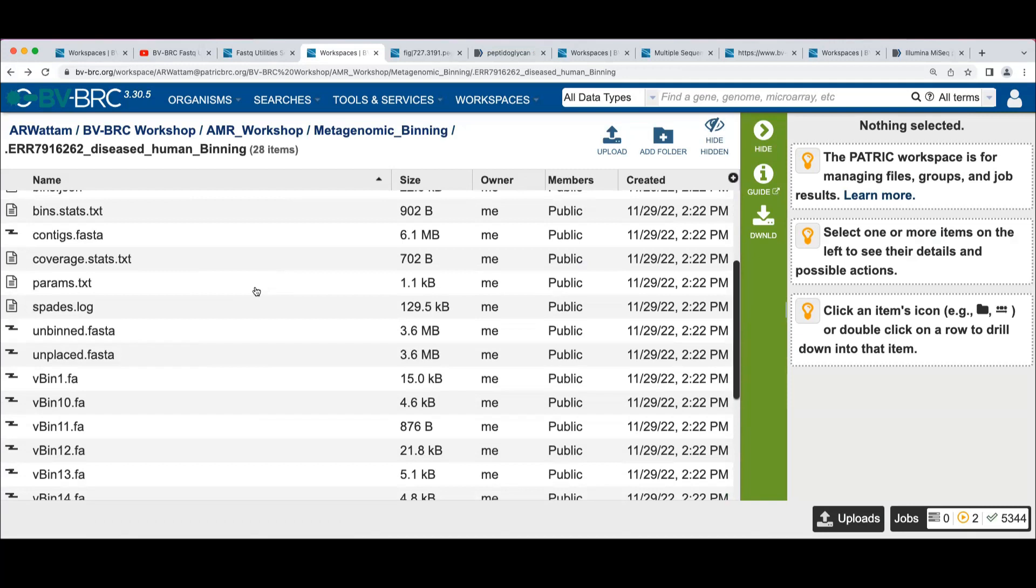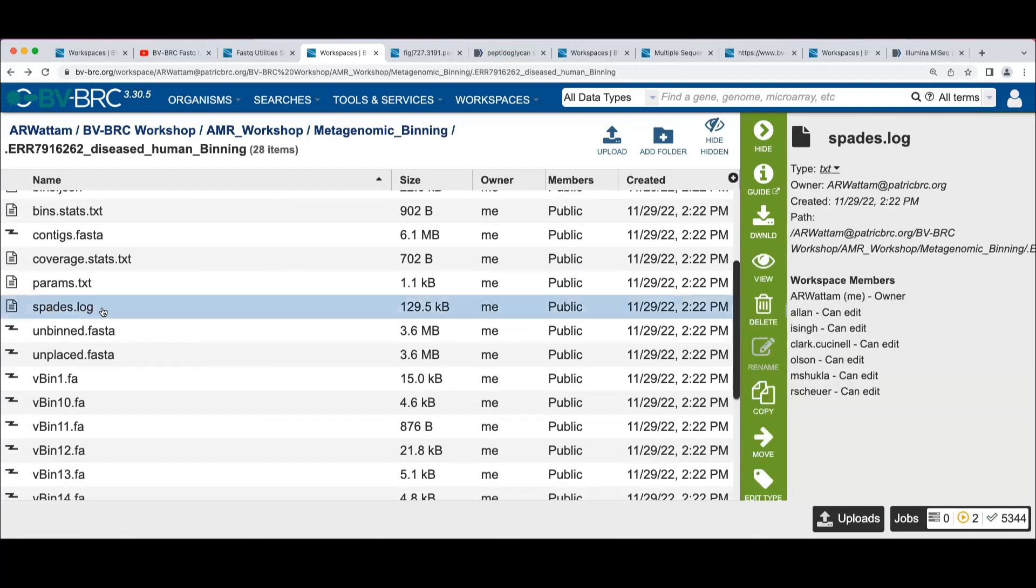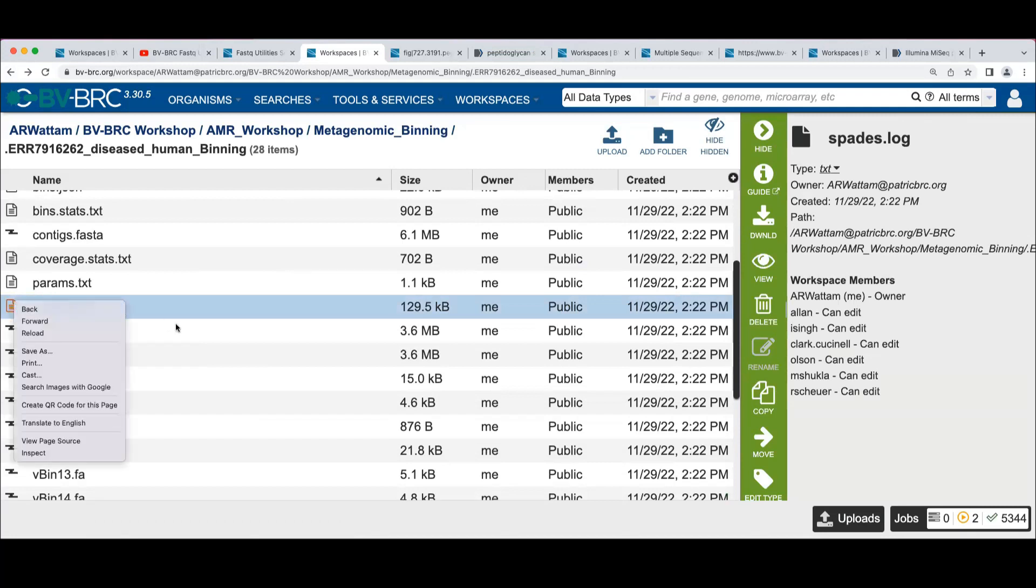You had said that you wanted to know how this was assembled. We don't directly have the mechanism of assembly, but the fact that we have a spades log file here shows that this job was assembled with metaspades.